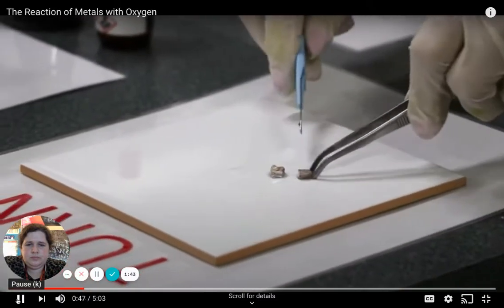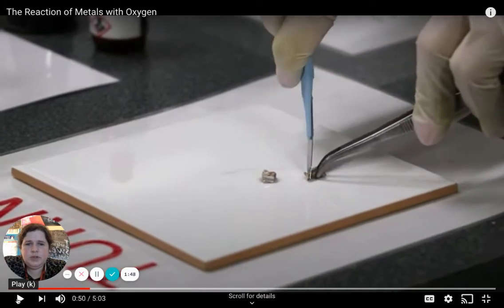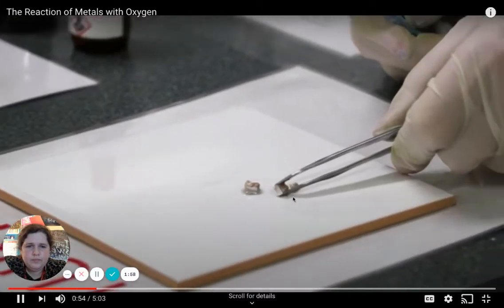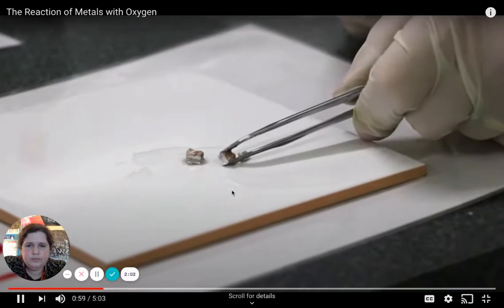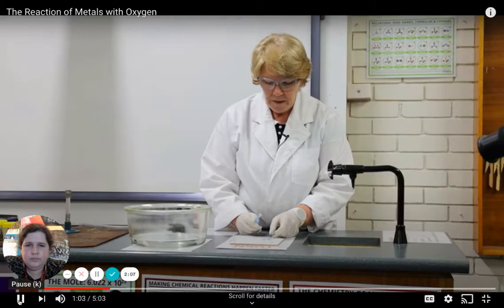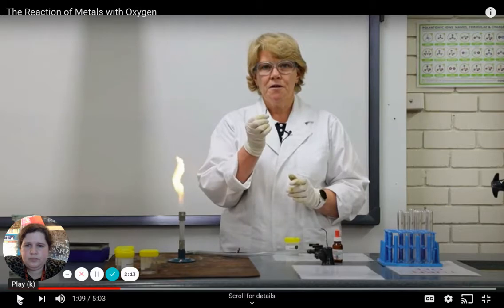I'm going to cut another fresh surface for you so that you can compare. So she's using some forceps, which are the tweezers, and a scalpel to slice the sodium. Do you see how it's already become more dull? In only a small amount of time. It's reacting with oxygen in the air around us. That's producing sodium oxide. Let's look at the reaction between magnesium and oxygen.